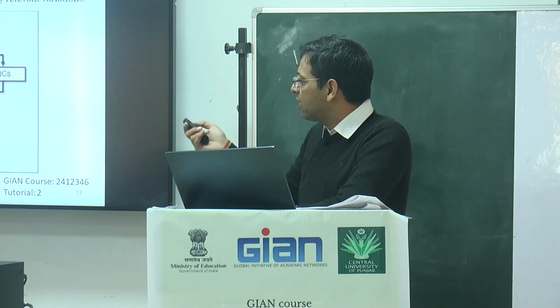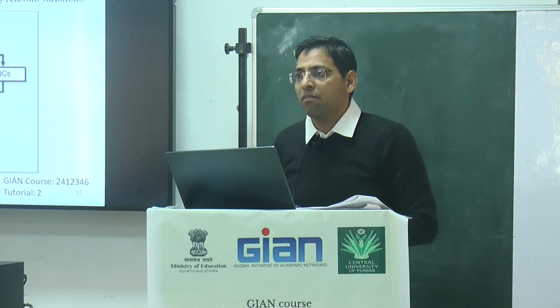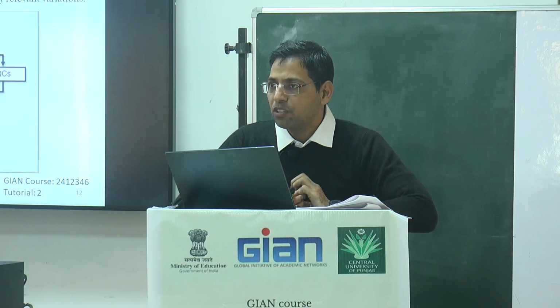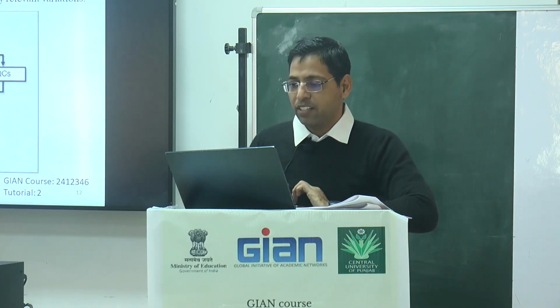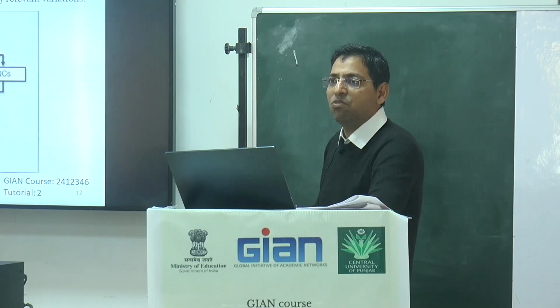So what are the surrogate sample, IS and the QC? We integrate the information retrieved from these three different things, and then we integrate the peak heights, use statistical evaluation, and finally we can identify the different biomarkers this way. So these are the key strategies for the normalization.